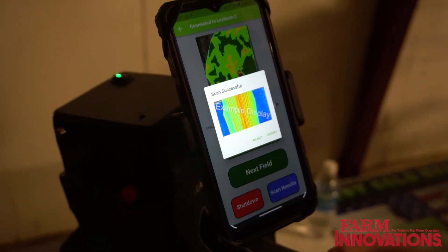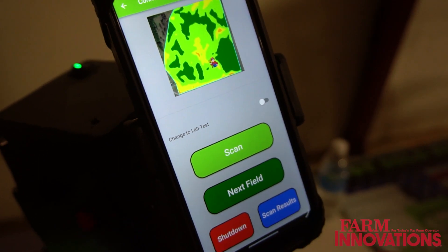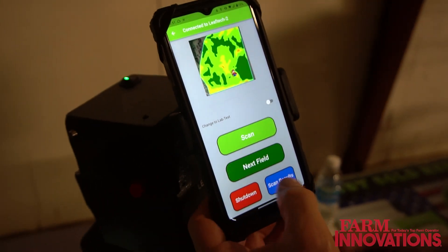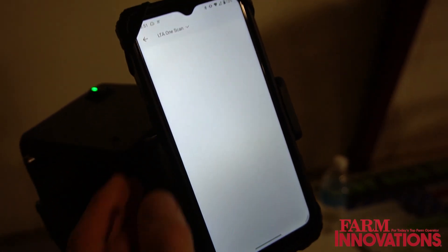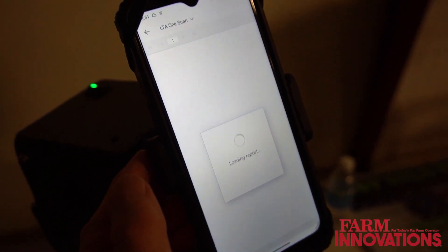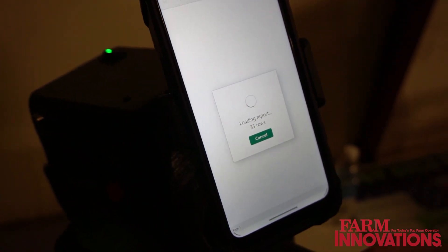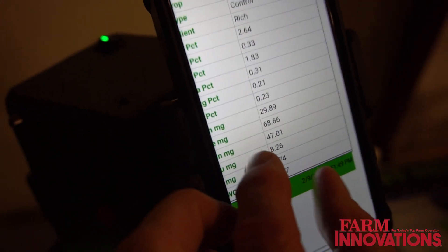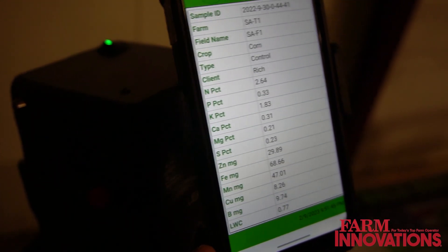We collect about a three by five inch area, which allows you to take a look at that leaf and confirm you want it. Then you can go to your scan results, where it pushes the data up to the cloud, where you can look at that geo-located data.